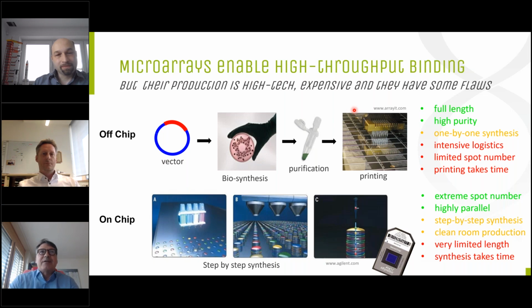So microarrays are basically small dots in a small space, to say it very basically as a non-scientist like me, enabling hundreds and thousands or even millions of biochemical measurements in one single experiment. Even today, microarrays are the core technology used in next generation sequencing, for example in Illumina. But at the moment, today's microarray production is sort of at a dead end, right?